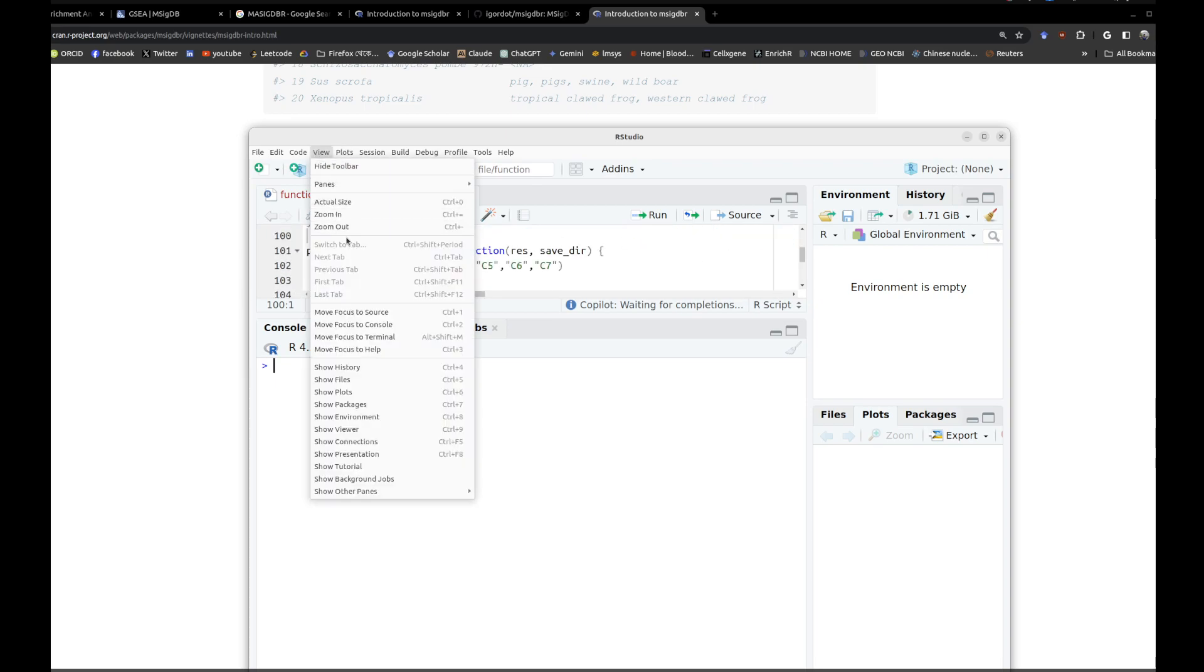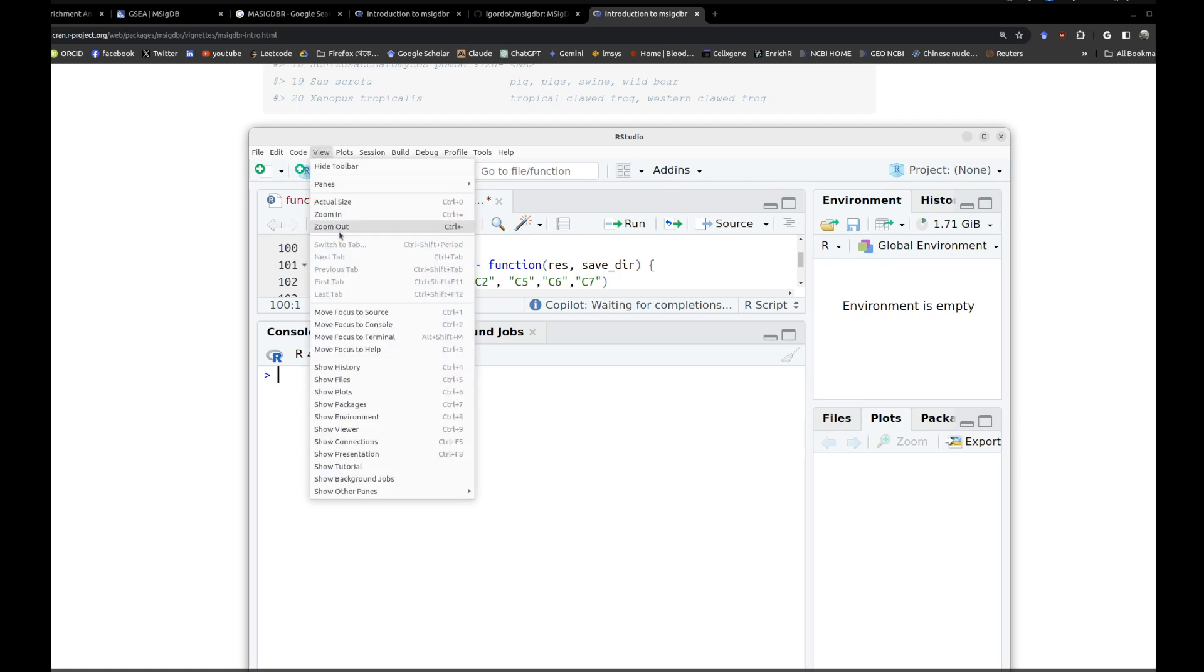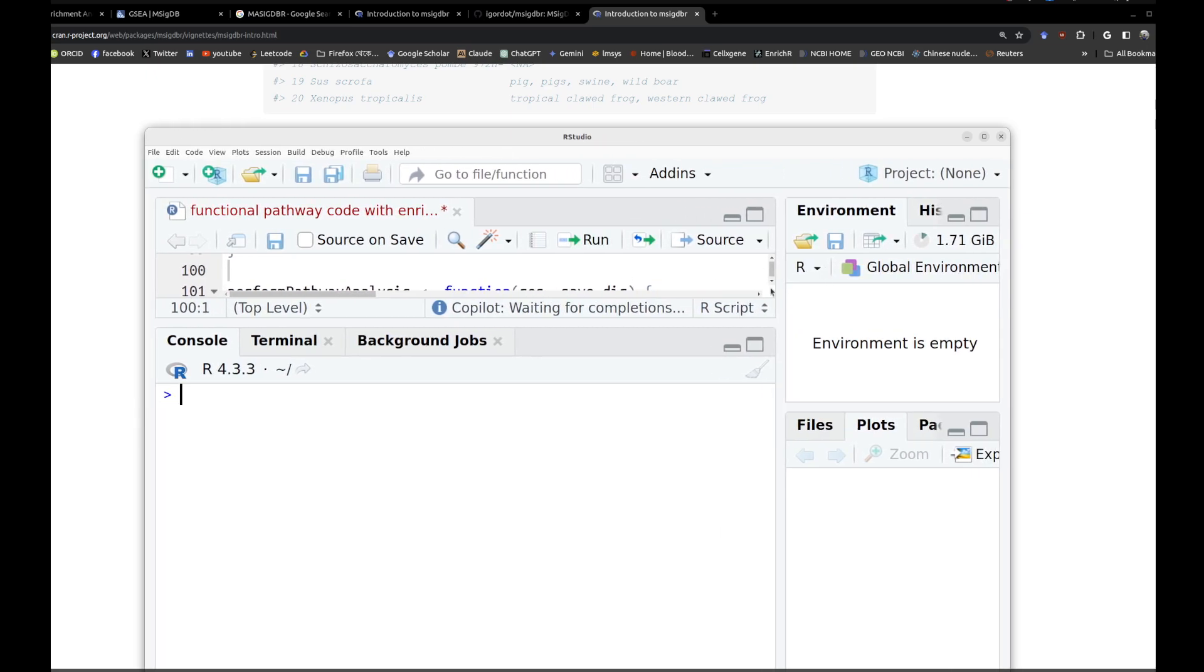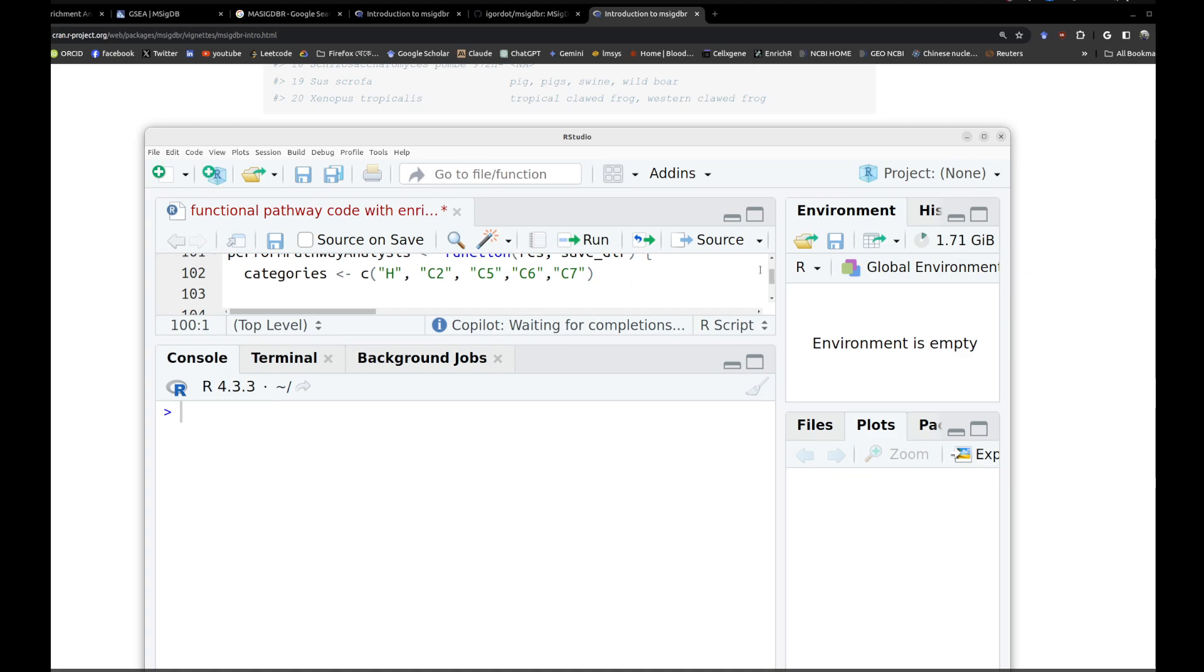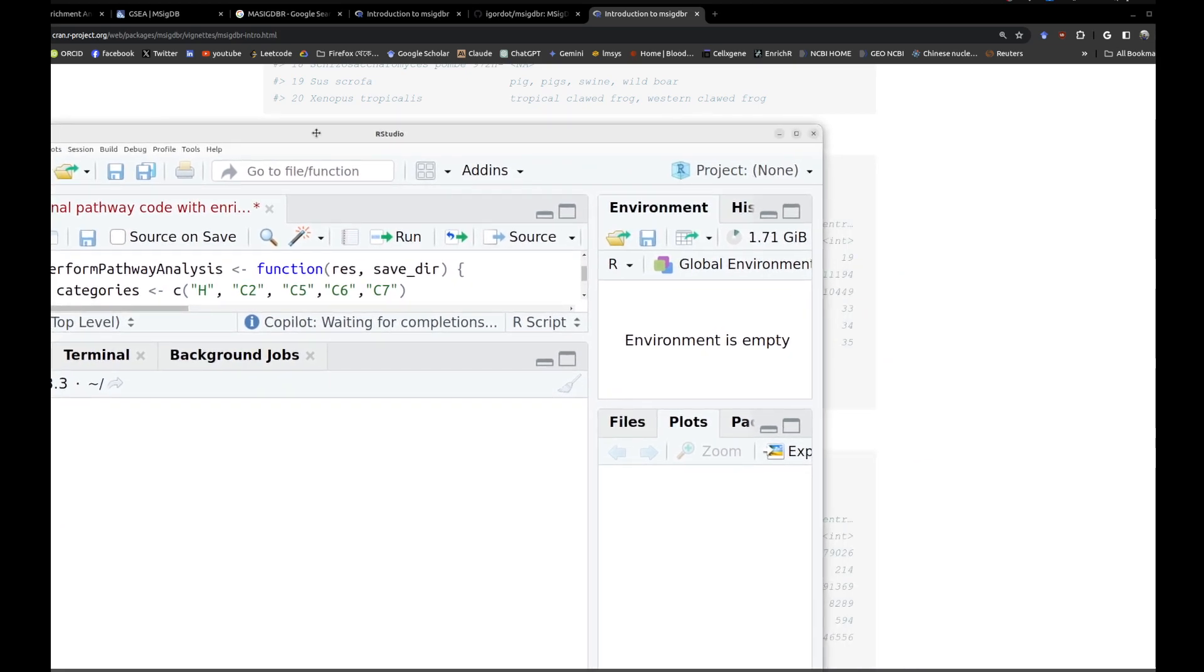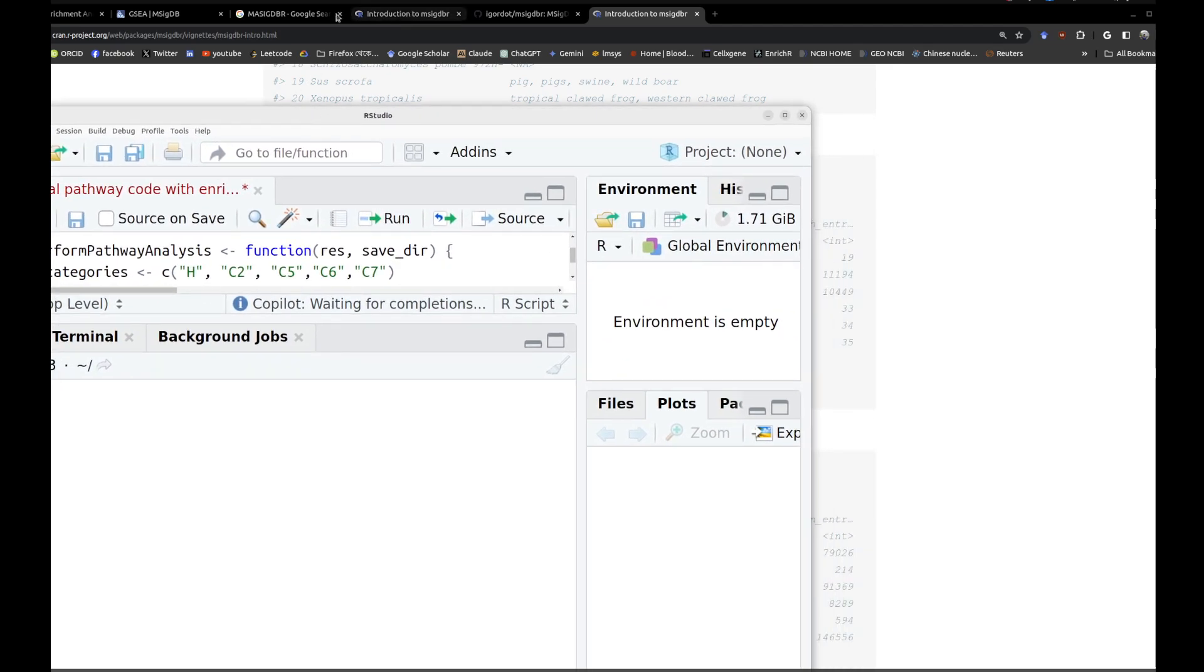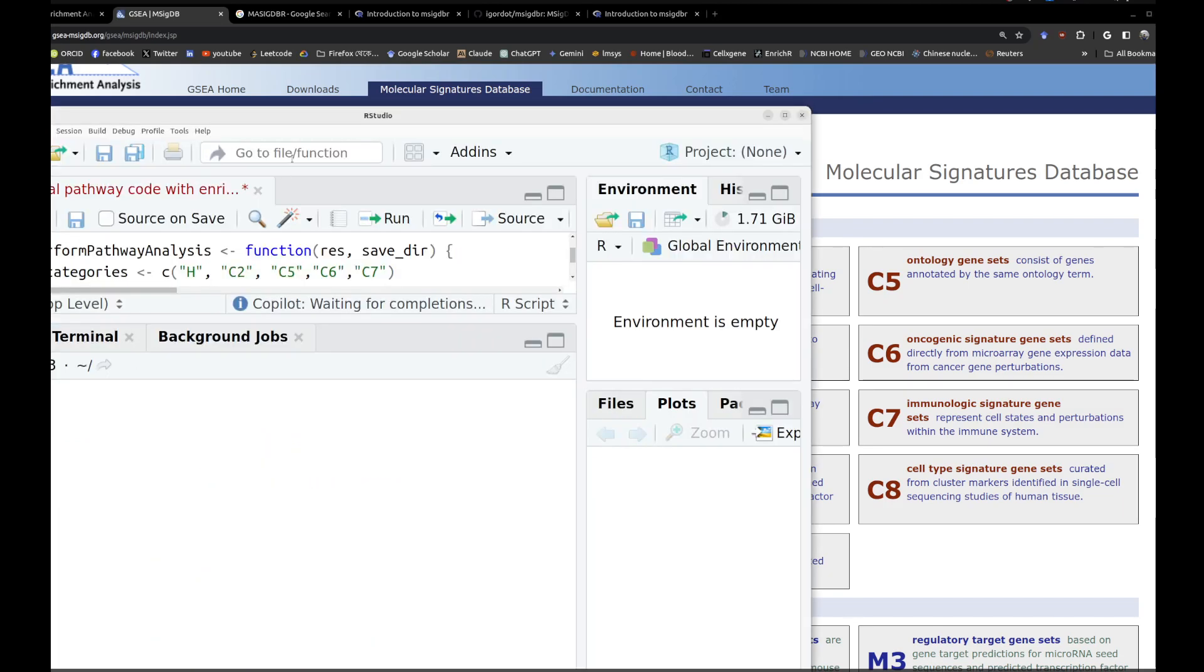If you look at this code, it's probably better in here on the bigger side. You can see that it is specifically asking you to perform along with all of these - probably three, four, or five of these specific categories within the human collections. So you can specify, okay, this is homo sapiens I want, then you specifically go for each of these datasets and then you just run your code.